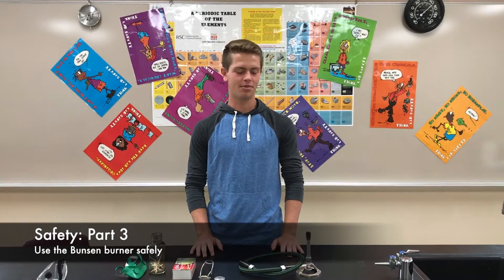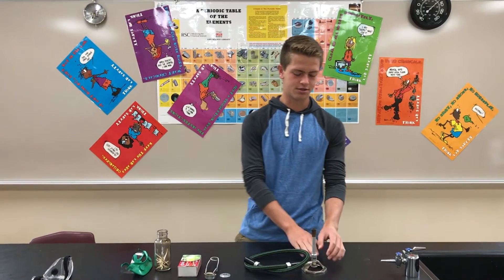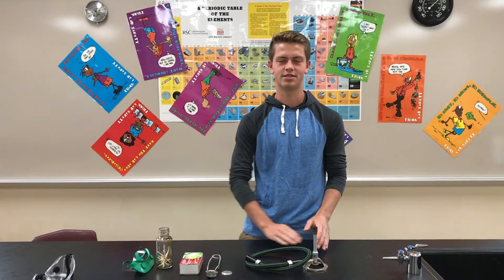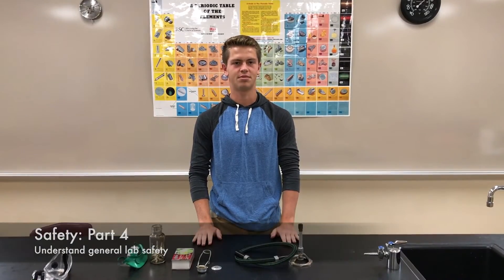Use the Bunsen burner safely. That means never leaving it unattended when it is lit, and always adjusting it from the bottom of the barrel, because the top and middle become very hot when it is lit. You should also know where the safety blanket, fire extinguisher, and other safety materials are.